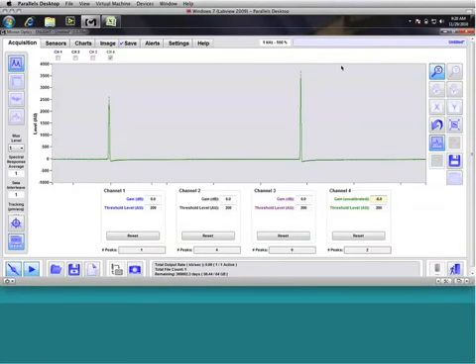It should be noted that for this demonstration, we've turned up the gains very, very high on our demonstration instrument, requiring that we reduce the gain to a large negative value. Typically, this would not be the case, but you should also be aware that should some situation arise, we have a very highly reflective peak, and perhaps there was a slight change in laser output power, the negative gains are available to compensate for that type of situation.